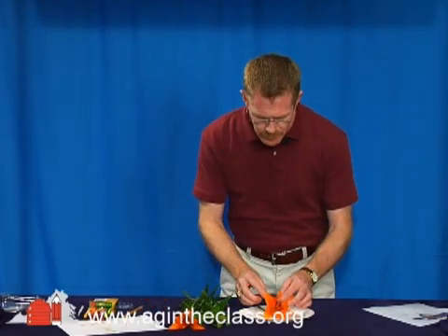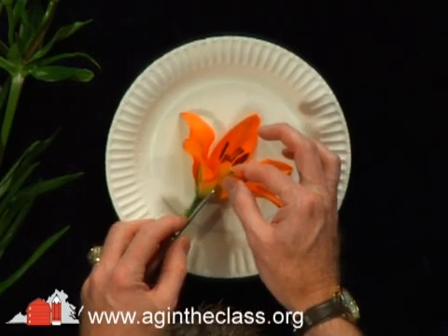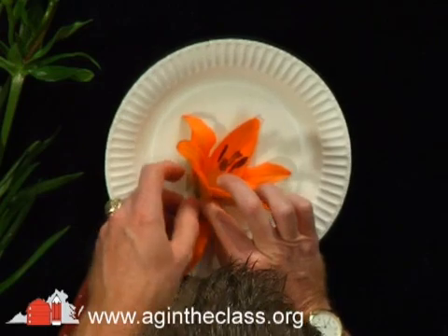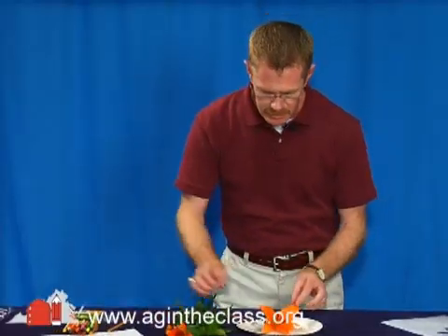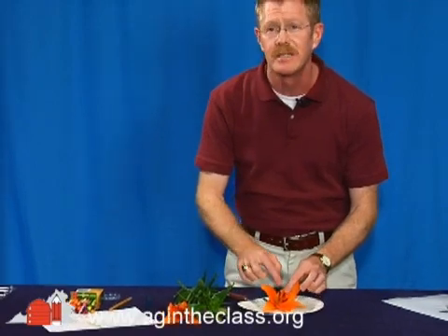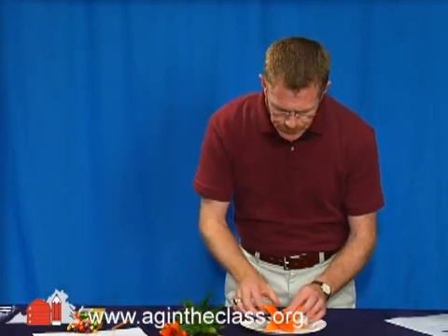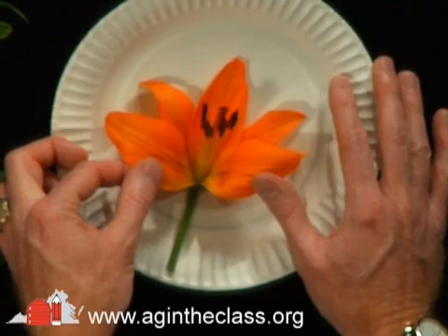You should cut through the lily petal very gently, and then just sort of peel that back and you can break it off. You can see where we've cut there just to get that open, because what we want to do is get to the inside of the flower so we can see those parts down inside. So we've removed the petal, and we're going to spread these other petals apart a little bit so you can see down in there.